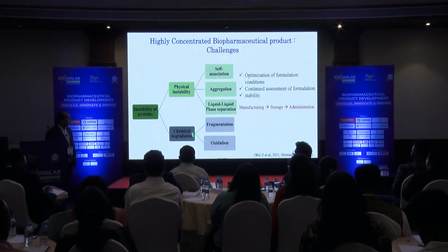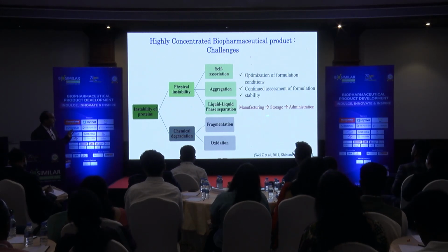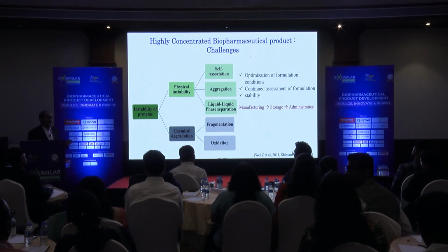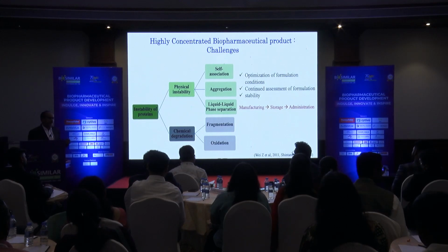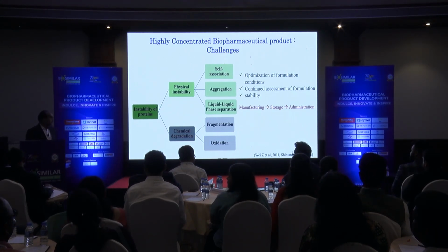Even after manufacturing, in filling the syringe or storing it, there is a probability that it can aggregate or degrade, or even during administration, protein conformation can change. Therefore, as Naratna made in the opening remark, they should be characterized at every step of the process.